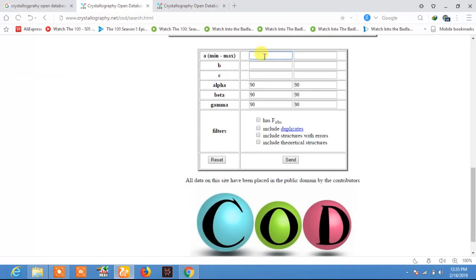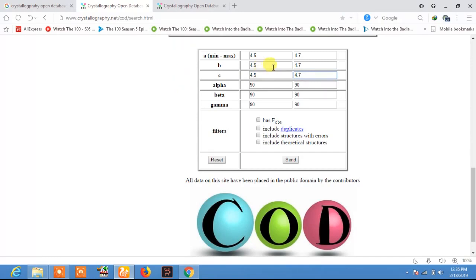So type 4.5 to 4.7 for A, similarly 4.5 to 4.7 for B, and 4.5 to 4.7 for C, because 4.6 lies between 4.5 and 4.7. Then set alpha, beta, and gamma each equal to 90 degrees.